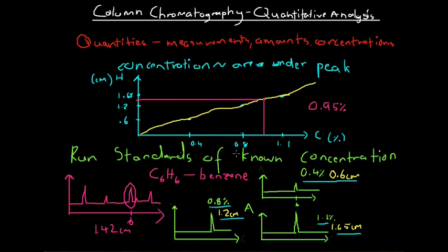And obviously it's very important in all of these situations, both when you're running these chromatograms and creating this graph, to create a thorough scale. So we want to make sure we measure it out properly like this when we're doing it. So every dash there is 0.1%, and so we want to make sure we create a really good tight scale so that when we use the height of our fuel sample to plug into our graph, we can get very accurate results.